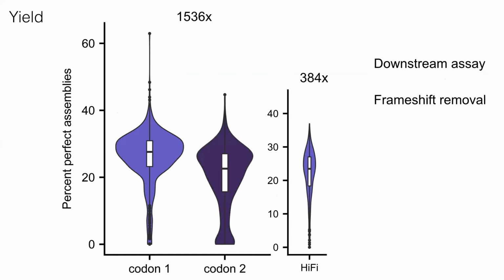With yields in this kind of region, considering also the skews in the distribution that I showed previously, I think you really have to take into account what you're using in terms of your particular downstream assay, and whether you can oversample in your functional assay enough that you can actually pick up everything that you want to pick up. So we've had people come to us interested in synthesis of a library only to tell us that they were using colony picking robots downstream. That's not really gonna cut it given these factors.